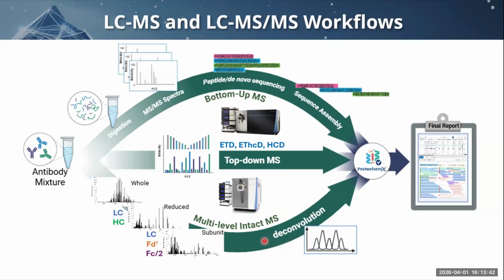species. At the top-down level here, which is sort of a bridge between the bottom-up and the intact, to get proteoform level information and modifications of proteoforms. The experiments presented in this work were done at the subunit level. And the fragmentation technique was ETciD. And so all of the data obtained from these experimental workflows was analyzed with our recently released software, Proteoform X, except for instances where I did use specific in-house software, which I will mention as the data is being presented.